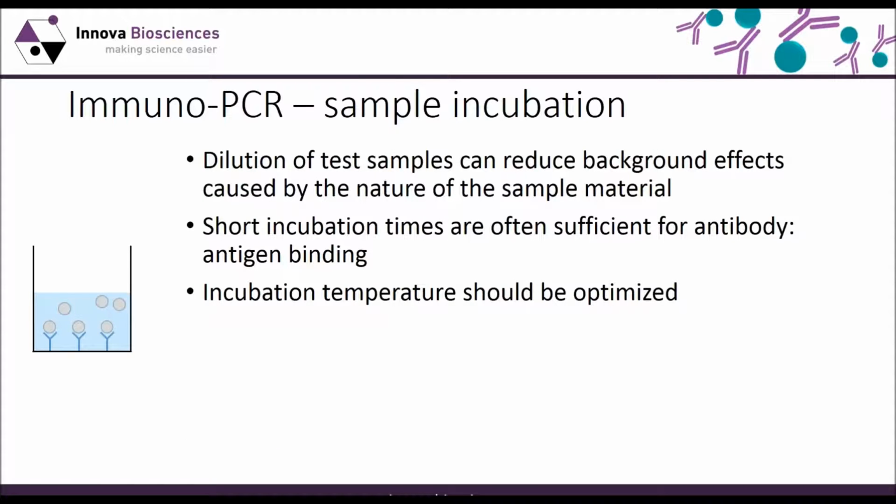Since Immuno-PCR provides such high levels of sensitivity, test samples can often be considerably diluted. This significantly reduces any background effects that may be caused by the nature of the sample material. The binding of the capture antibodies to the antigen is a specific high-affinity interaction. Because of this, short incubation times are often sufficient for the sample incubation step, although this should of course be optimised during assay development. It's also important to determine an appropriate incubation temperature for this step.